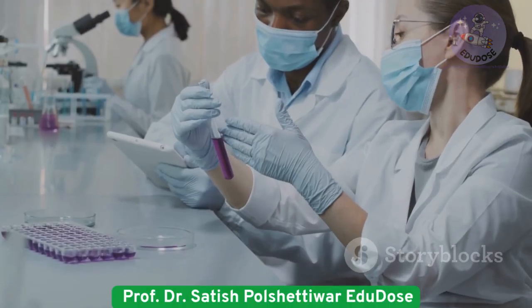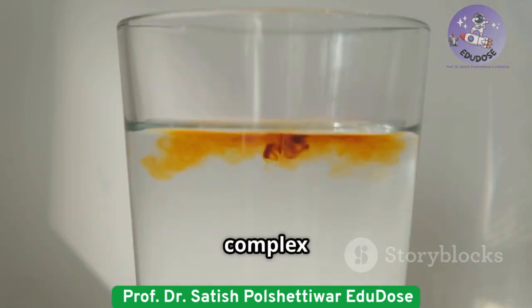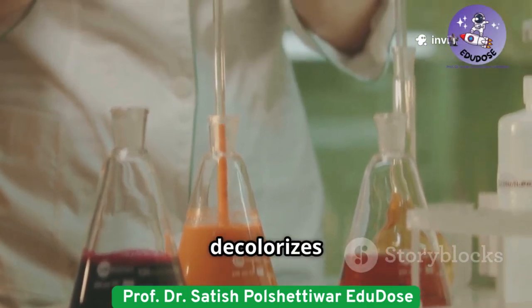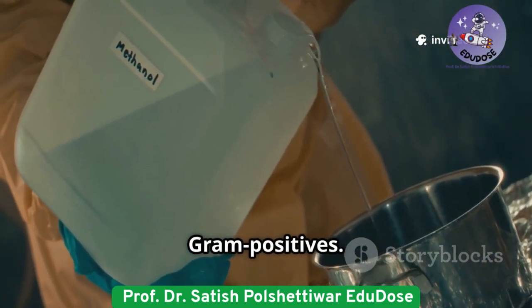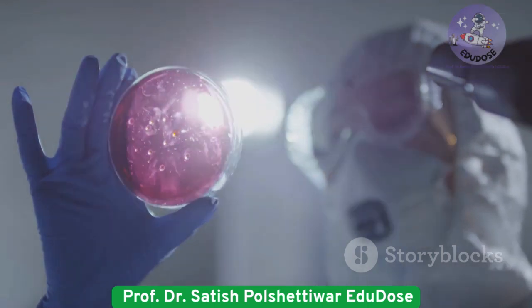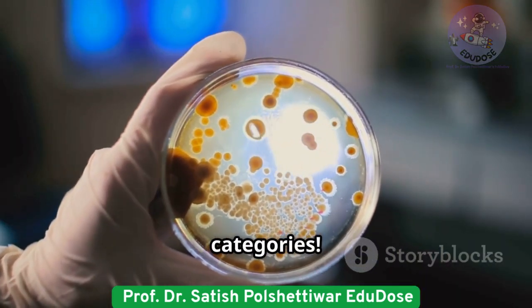Here's the gram staining process in a nutshell. First, crystal violet, all cells turn purple. Next, iodine forms a complex with the dye. Then, alcohol or acetone. This decolorizes gram-negatives but not gram-positives. Finally, safranin. Gram-negatives now show up pink. Just like that, one stain splits bacteria into two categories.